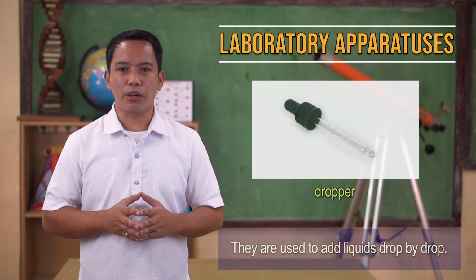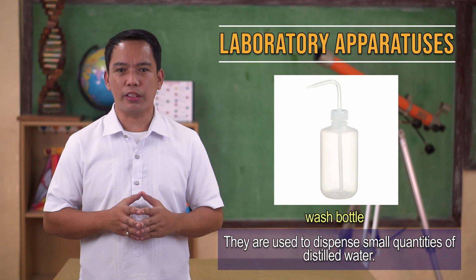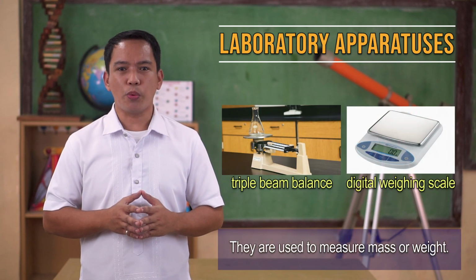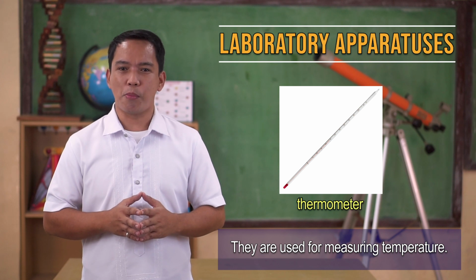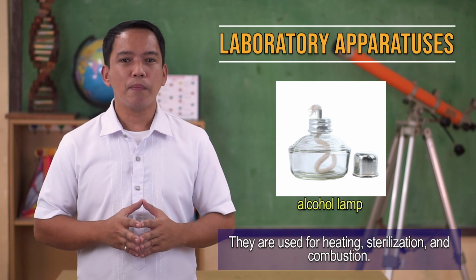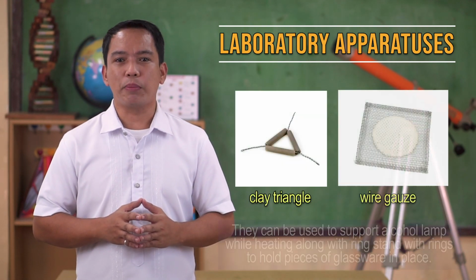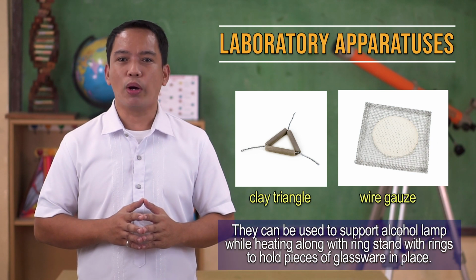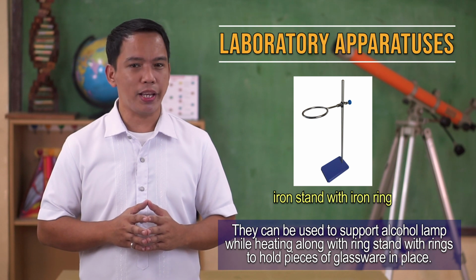To add liquids drop by drop, droppers are used, while to dispense small quantities of distilled water, we can use wash bottles. To measure mass or weight, triple beam balance or digital weighing scale are used, while for measuring temperature, we can use thermometer. For heating, sterilization, and combustion, we can use alcohol lamp. Clay triangle and wire gauze can be used to support items while heating, along with ring stand with rings to hold pieces of glassware in place.